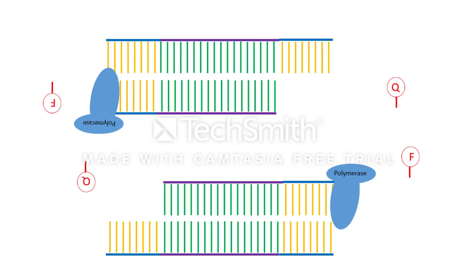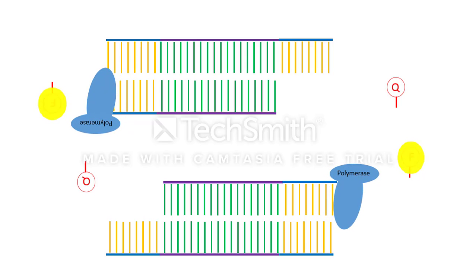The qPCR machine is then able to record and quantify the fluorescence that occurs at each cycle of the replication process. The amount of fluorescence becomes measurable after a threshold cycle or crossing point has been reached. This threshold value will now be discussed next.